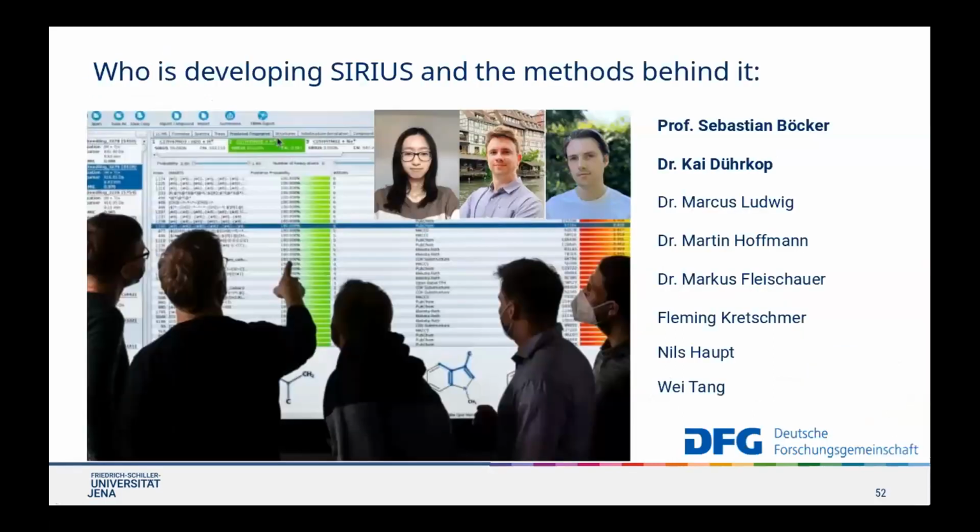And this is our group. This is currently all the people working on Sirius. And with that, I would hand over to Fleming to start the live demo.